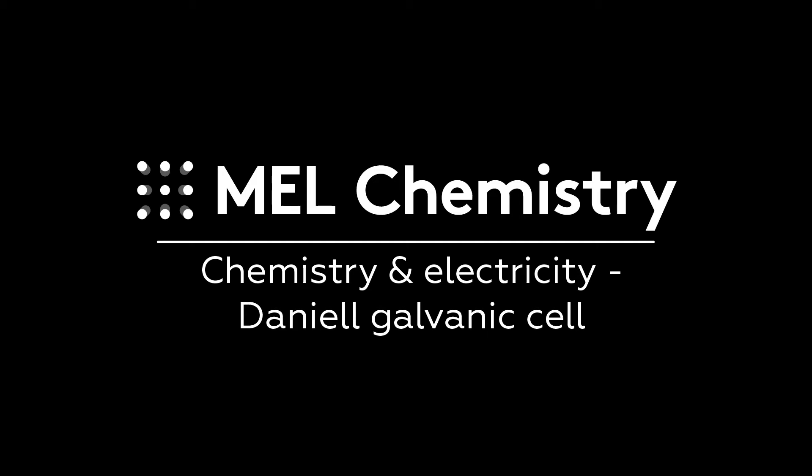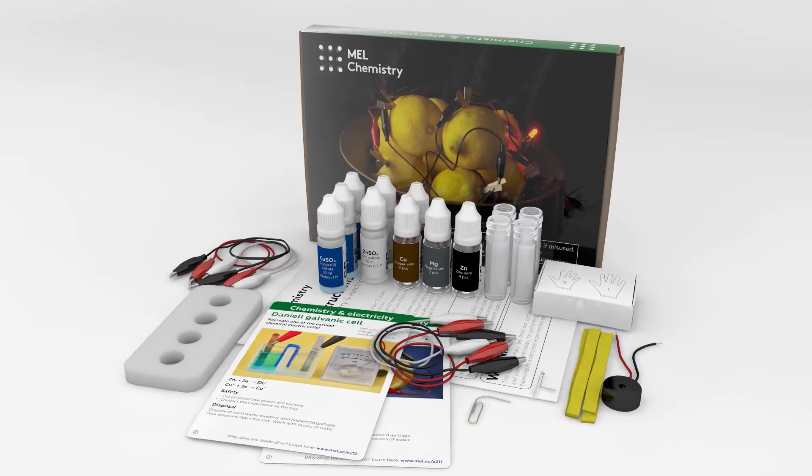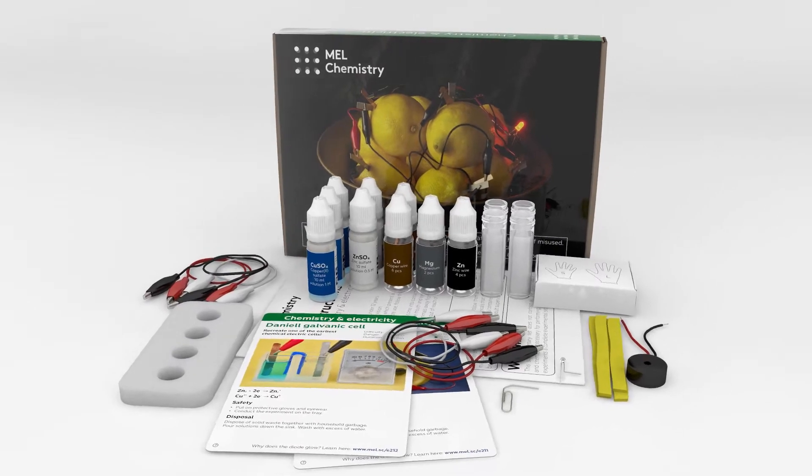Welcome to the wonderful world of chemistry. Today, with the chemistry and electricity set by Melchemistry, we will make our own chemical battery, a Daniel Galvanic cell.